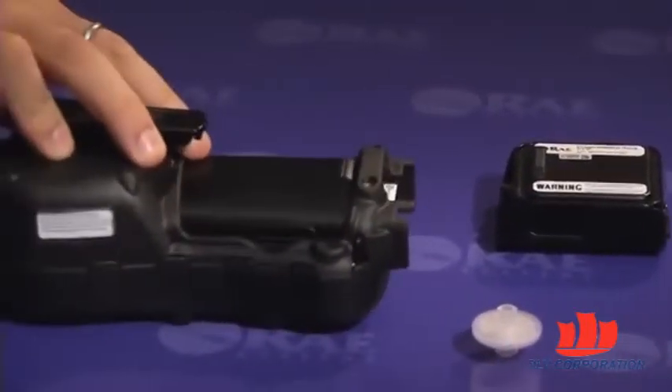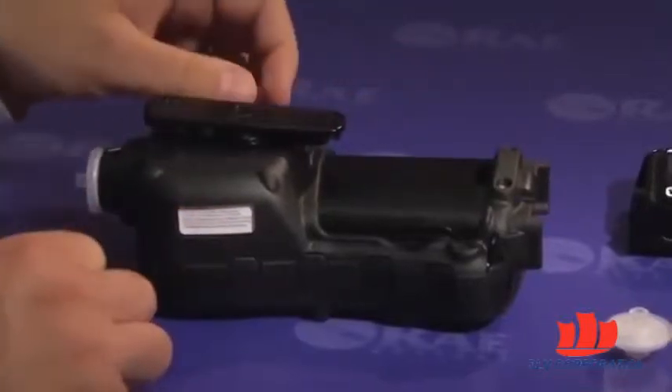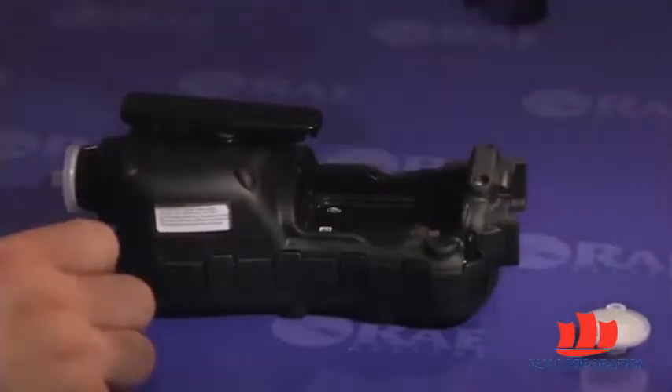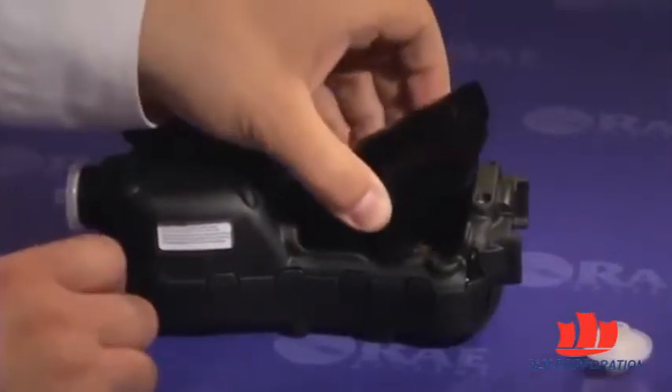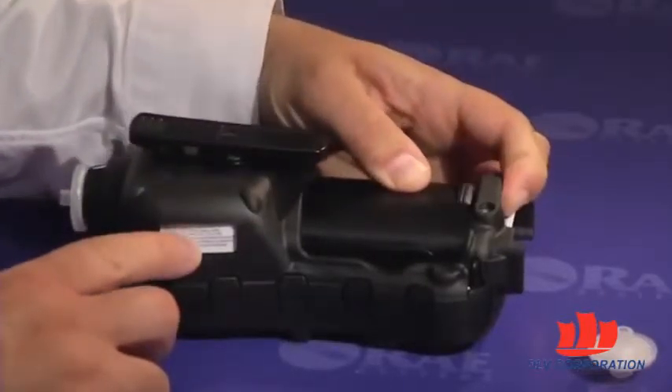First, remove the battery from the instrument by sliding the tab and tilting the battery out of its compartment. Second, tilt a fully charged battery into the battery compartment and then insert it fully. Next, slide the tab back into place to secure the battery.